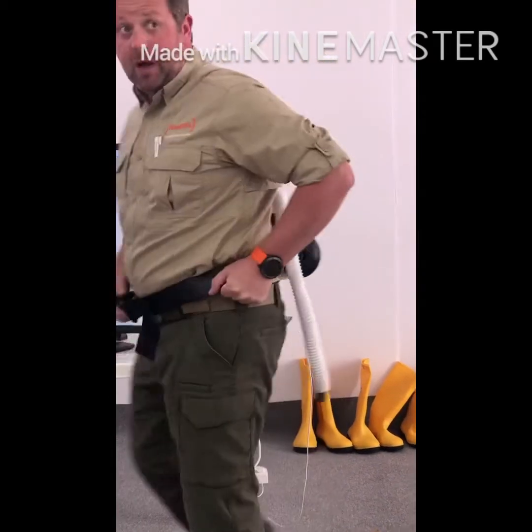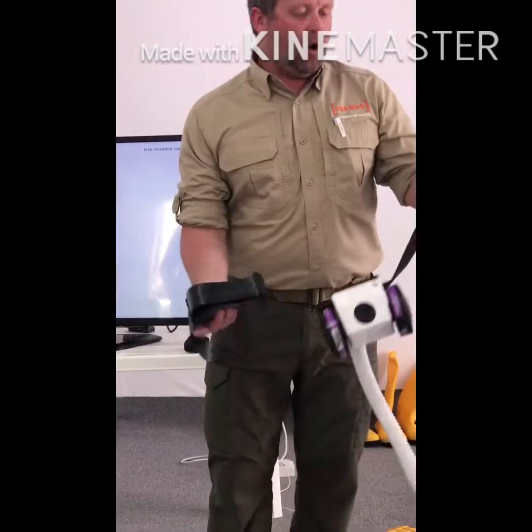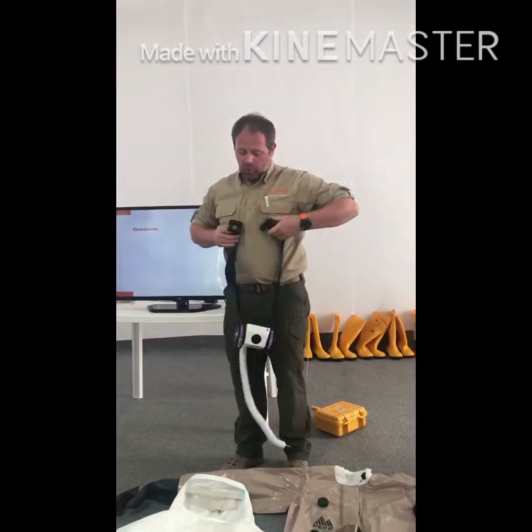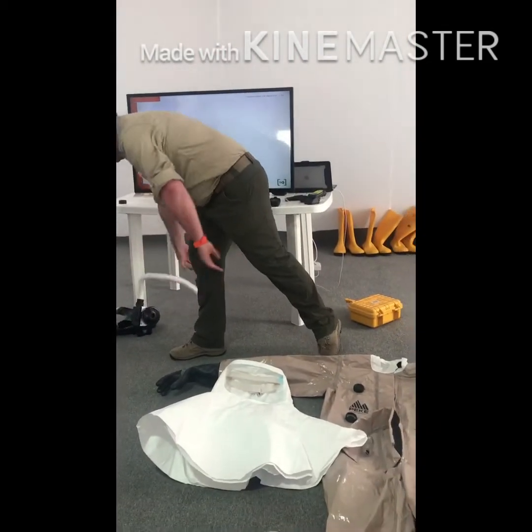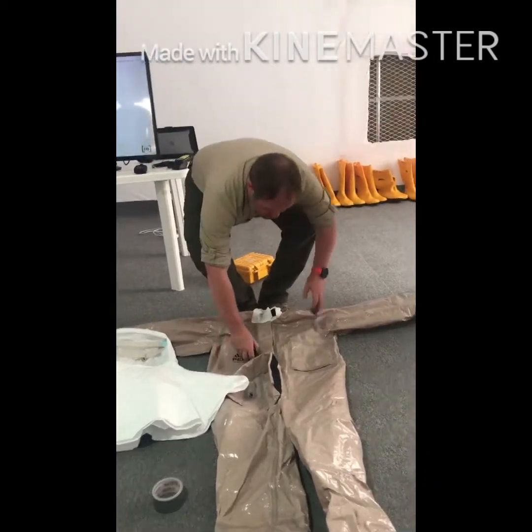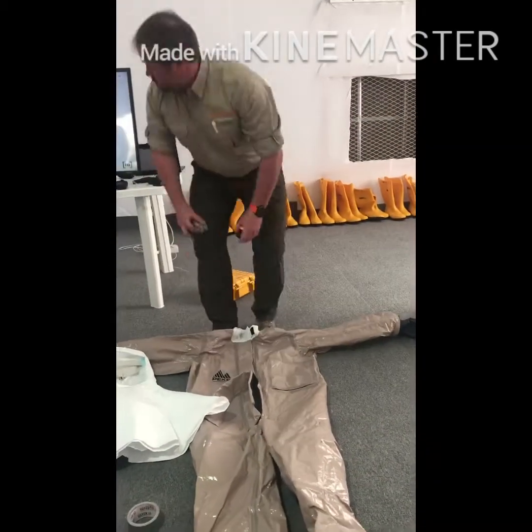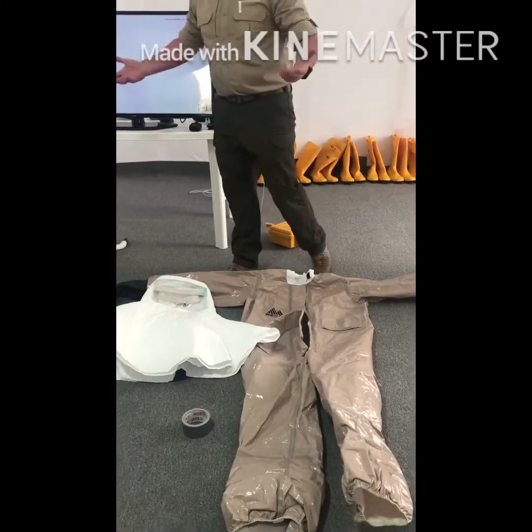Okay? Everyone happy with that so far? Good. Once I'm happy that that all works, I place that to one side. I'm then going to get my suit. My suit will come in a bag, which again will have an expiry date on it. So check the expiry date.